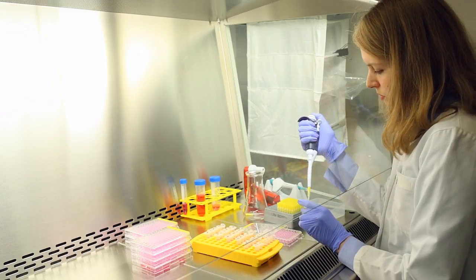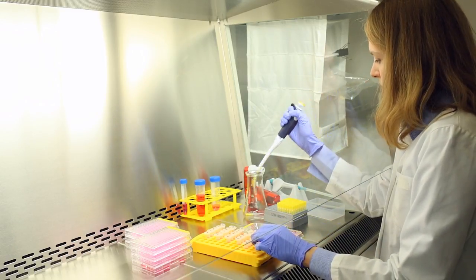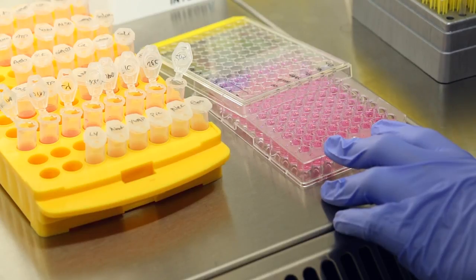If you are working with labware of different formats, you've been restricted to the use of single-channel pipettes. Common labware, such as tubes, cannot be accessed with conventional multi-channel pipettes because the tip spacing does not match.